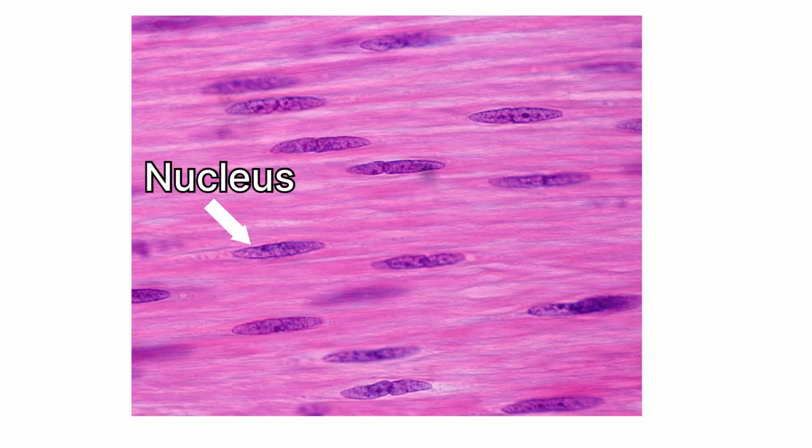Lastly, smooth muscles. These are spindle-shaped cells with a large elongated nucleus. There are no striations present, because actin and myosin are not arranged in sarcomeres like the skeletal muscle. Instead, filaments are arranged in a crisscross pattern. These are found in the GIT, blood vessels, uterus and urinary bladder.